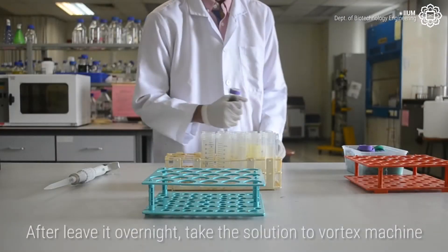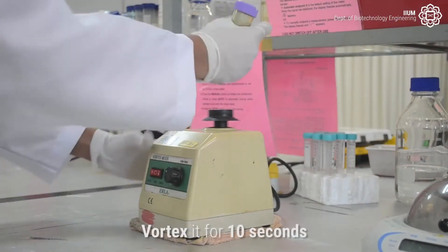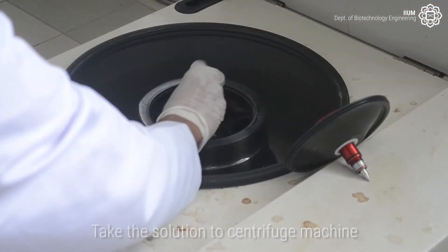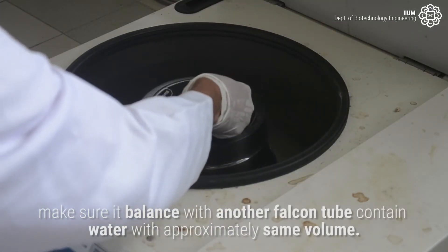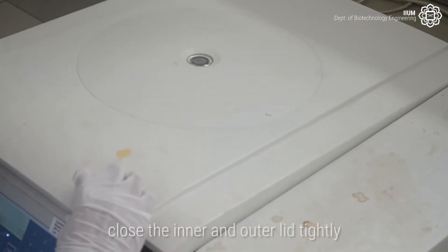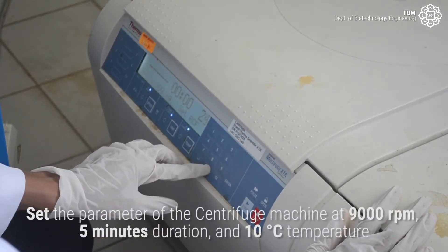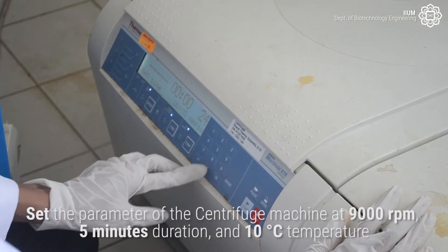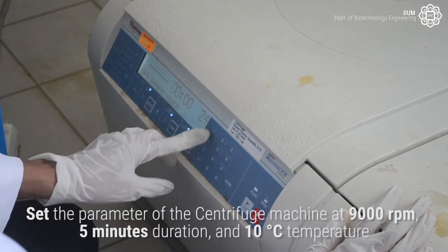After leaving it overnight, take the solution to the Vortex Machine and vortex it for 10 seconds. Take the solution to the centrifuge machine, making sure it is balanced with another falcon tube containing water at approximately the same volume. Close the inner and outer lid tightly. Set the centrifuge parameters to 9000 revolutions per minute, 5 minutes duration, and 10 degrees Celsius temperature.